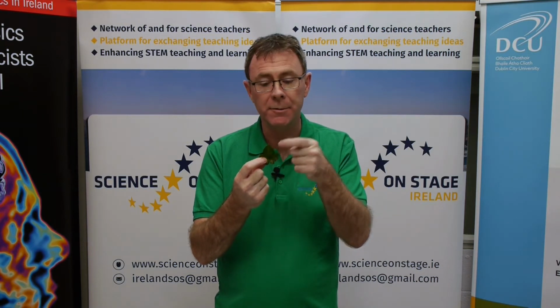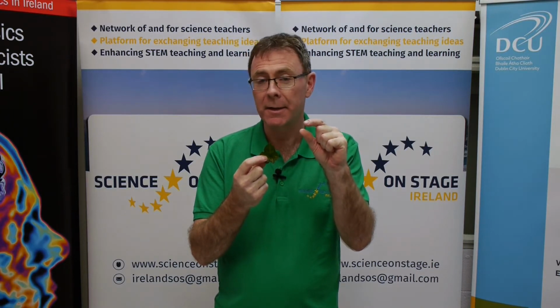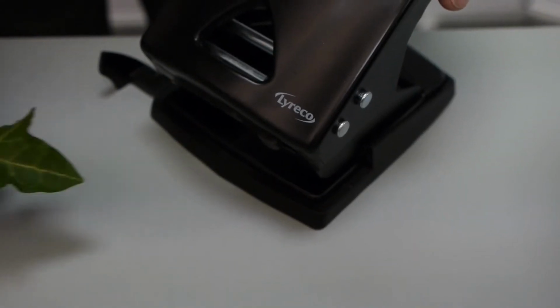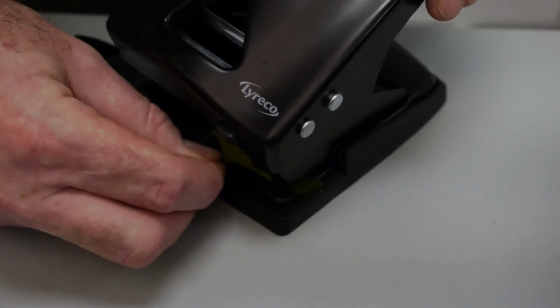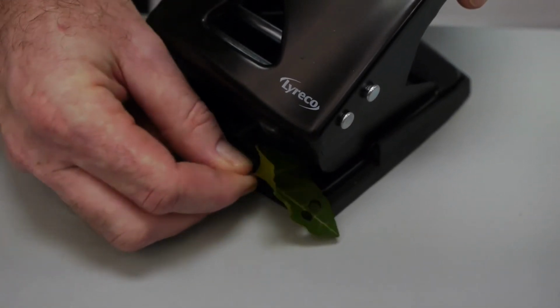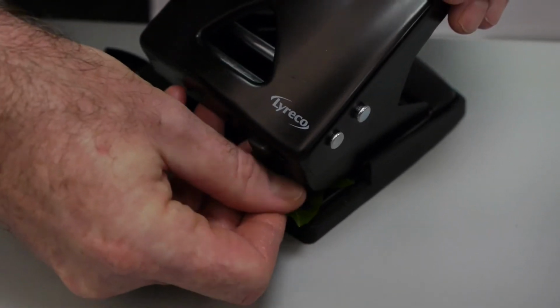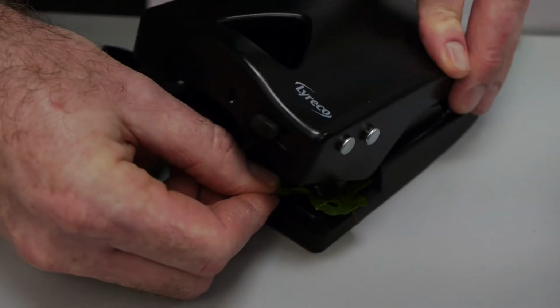Ulrike suggests that ivy leaves are really good for this activity because when you punch holes to make these small ivy leaf discs, the discs stay intact because the leaves are good and stiff. So you use a regular hole punch, and you need to punch 15 or 20 discs from ivy leaves. These ivy leaves need to be freshly picked so that they've been actively photosynthesizing.